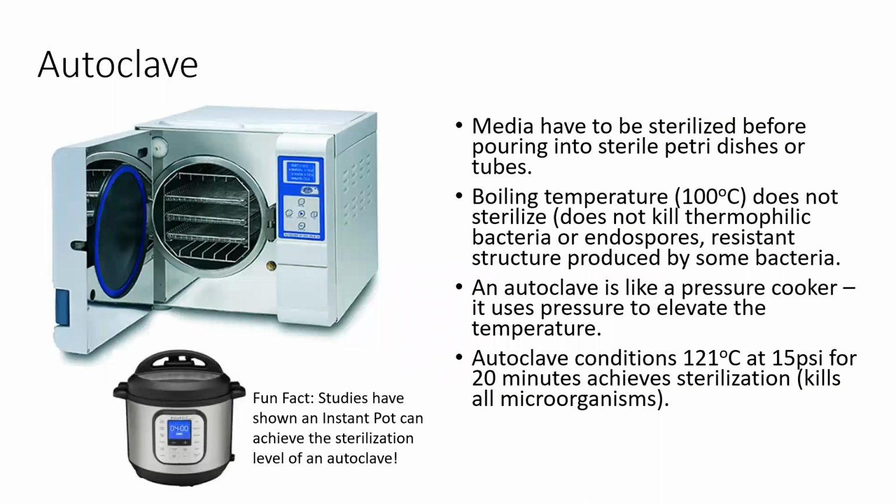We put it in an autoclave, which sterilizes the media, which means it kills any living thing, including endospores. And so the agar reaches 121 degrees Celsius at 15 PSI, which is a lot of pressure, for 20 minutes. So essentially it is creating superheated steam. And these conditions will kill, like I said, any living thing. It reaches sterilization, okay? So once the 20 minutes have passed, the pressure decreases and eventually we can open the autoclave carefully because a ton of really hot steam comes out. And the liquid in the flask is still bubbling. It's crazy hot. You have to use these big hand warmers to make sure you don't burn yourself.